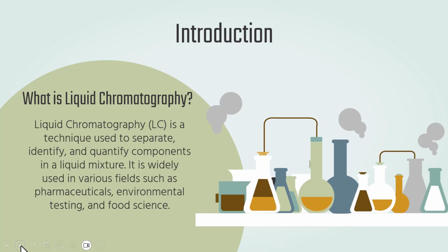In simple terms, liquid chromatography, LC for short, is a method used to separate different components in a liquid mixture. This technique is widely used in various fields such as pharmaceuticals, environmental testing, and food science. For example, in pharmaceuticals, liquid chromatography helps ensure the purity and composition of drugs. Environmental testing is used to detect pollutants in water and soil.